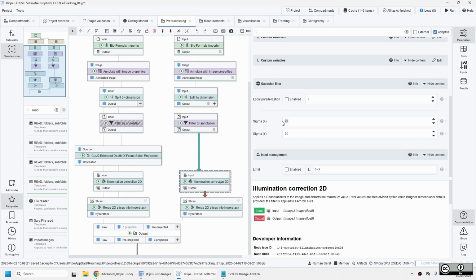I just want to remove this large-scale inhomogeneous illumination. So I set these filters to quite large. If you set them to very small, they start to remove the actual contrast details of the transmitted light image. So you set these to 20 or 50, whatever then fits.